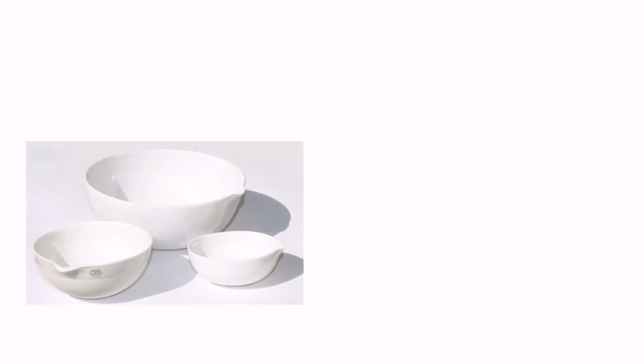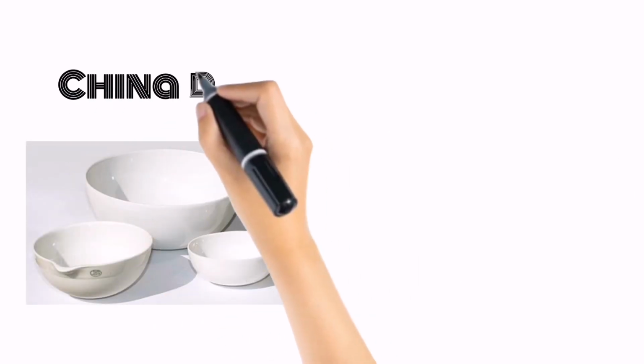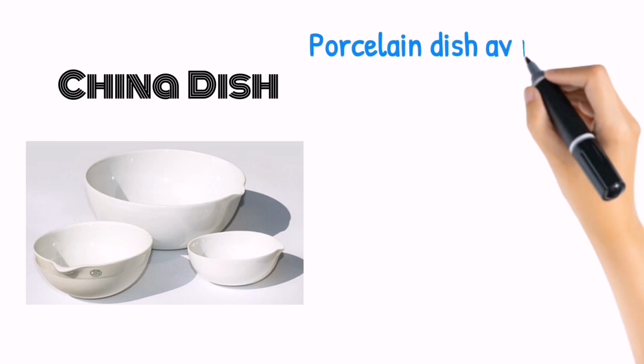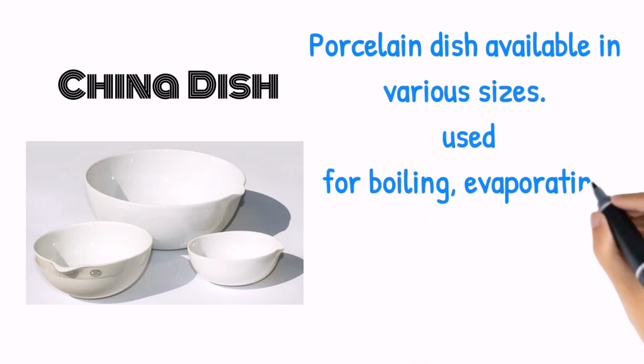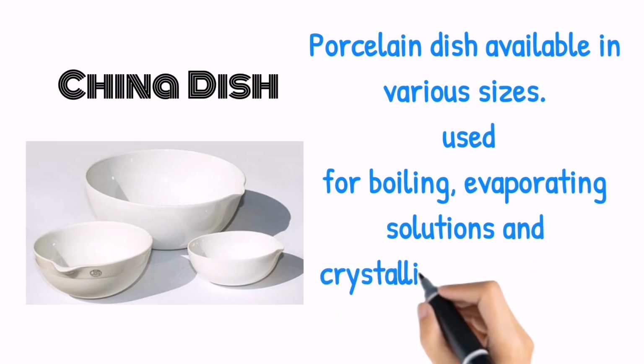China dish, also known as evaporating dish. Porcelain dish available in various sizes. Used for boiling, evaporating solutions and crystallization of salts.